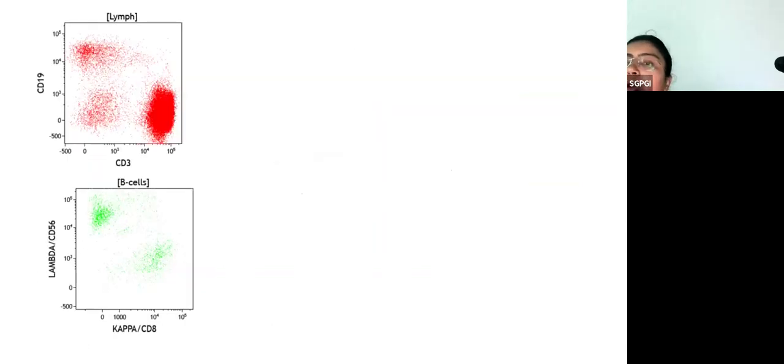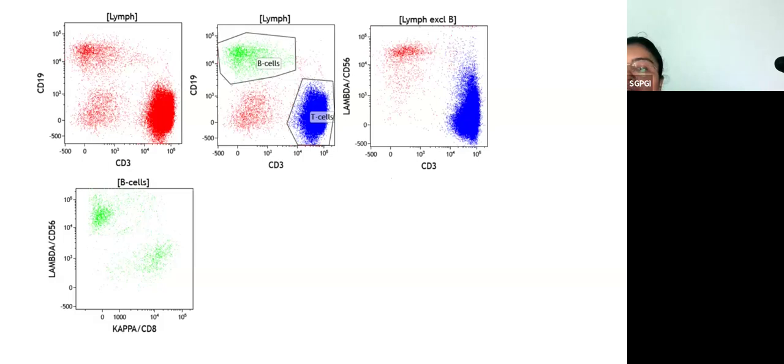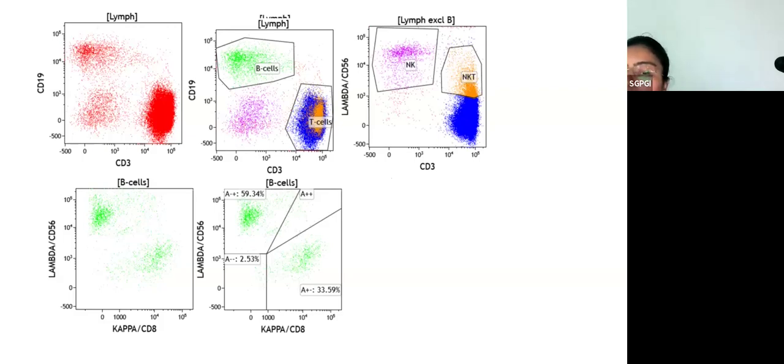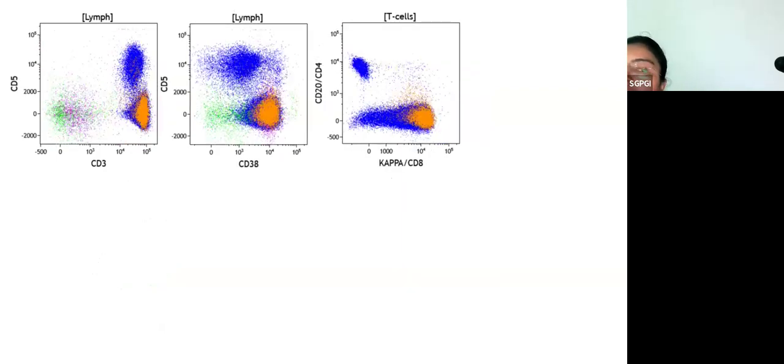Looking at the cells here, time plot, singlet plot, and the NDCE plot, once you clean everything up, you realize that you have a dominant population which is CD45 positive. Based on the CD19 and CD3 plot, you see a huge amount of CD3 positive cells. The B cells are nicely fitting into the polyclonal pattern for kappa and lambda. For the T cells, CD56 is present on a subset. The minute you assess CD3 with CD5, you have a split into two populations. You have a population which is completely negative for CD5.